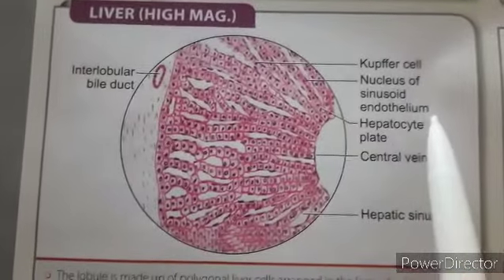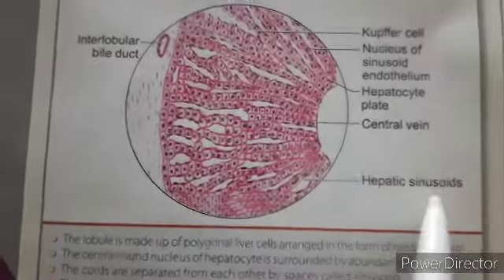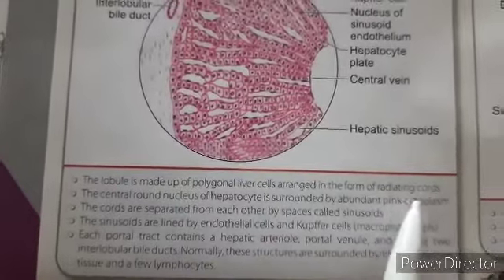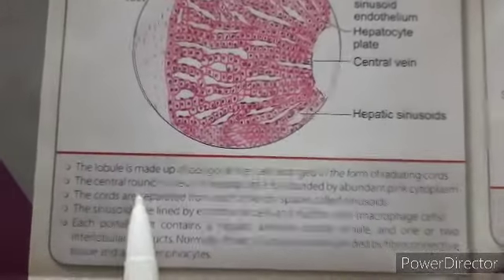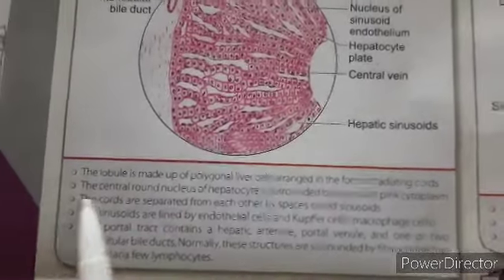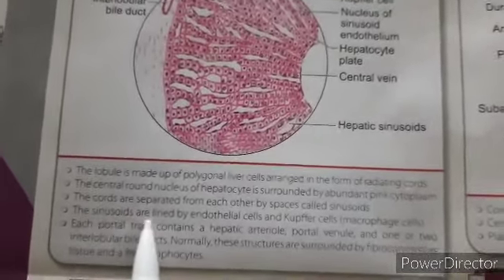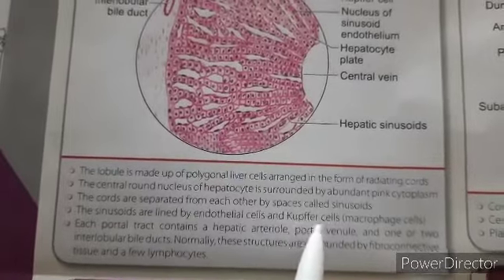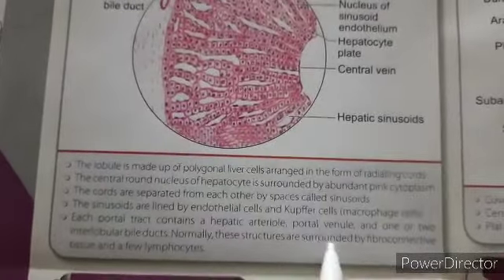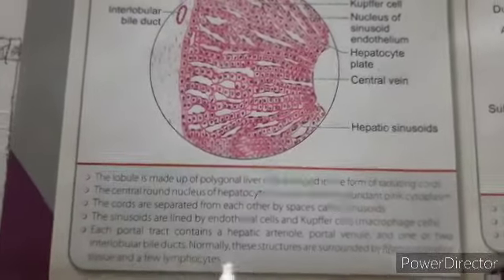Now the histology of the liver. Visible structures include interlobular ducts, Kupffer cells, nucleus of sinusoid endothelial cells, hepatocyte plates, central vein, and hepatic sinusoids. The lobule is made up of polygonal liver cells arranged in radiating cords. The central round nucleus of the hepatocyte is surrounded by abundant pink cytoplasm. The cords are separated by spaces called sinusoids, which are lined by endothelial cells and Kupffer cells. Each portal tract contains a hepatic artery, portal venule, and one or two interlobular bile ducts.